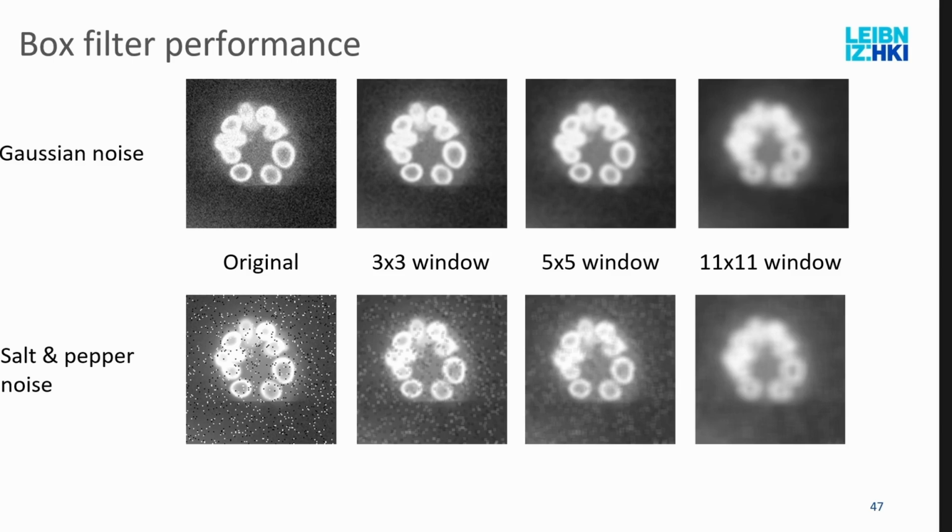But for salt and pepper noise, this absolutely does not work. It makes these dots even larger in the 3x3 window, and there are still artifacts left in the 5x5. And then here it's anyway super destroyed regardless.